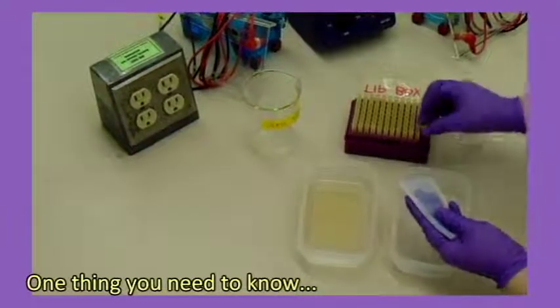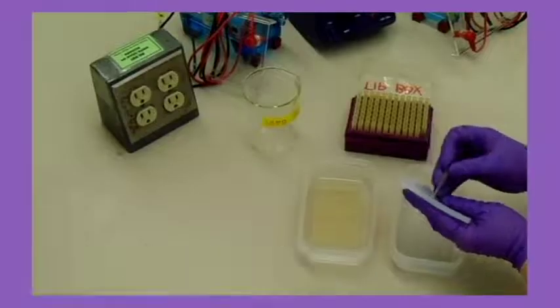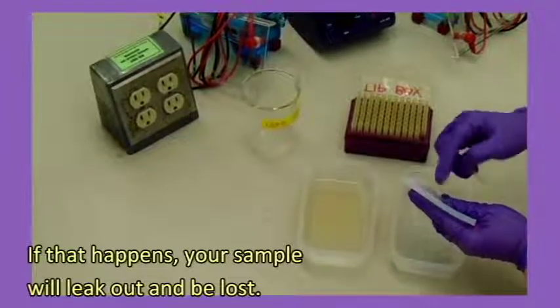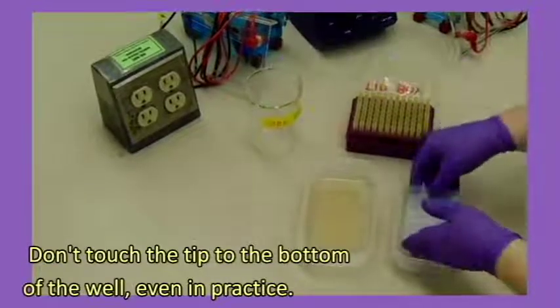One thing you need to know, it's soft and it's easy to poke through the bottom of the well. If that happens, your sample will leak out and be lost. Don't touch the tip to the bottom of the well, even in practice.